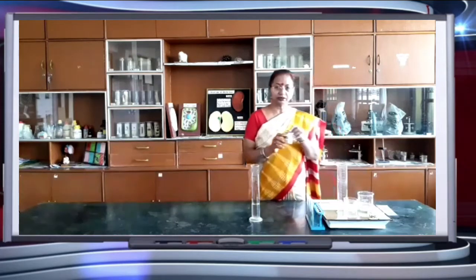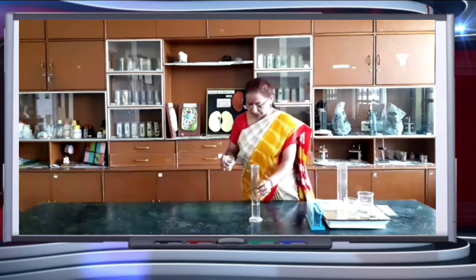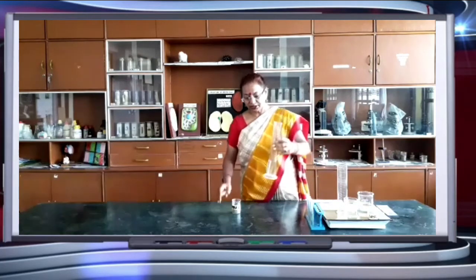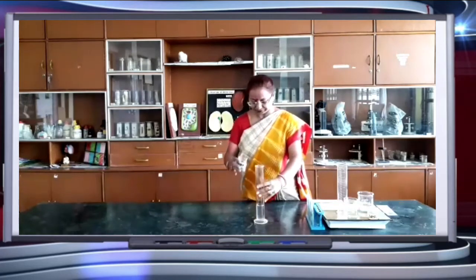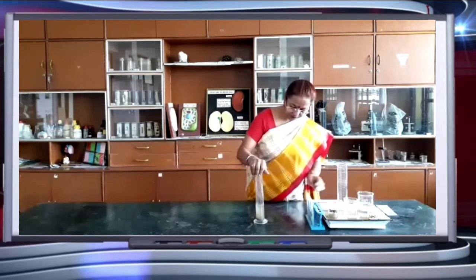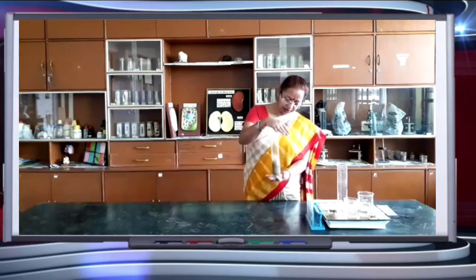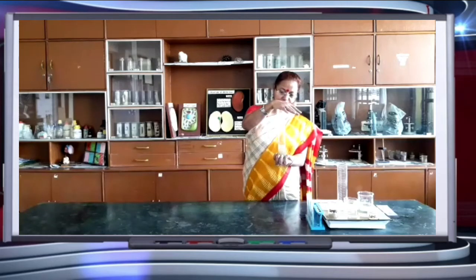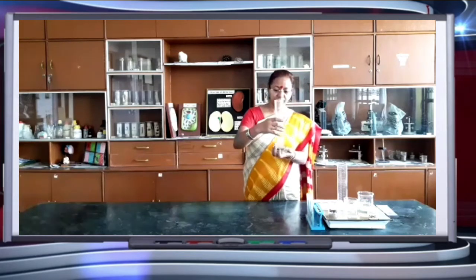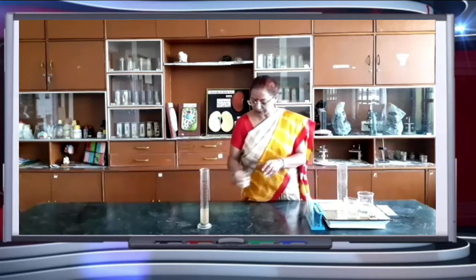This is sample 1 which I am adding in this measuring cylinder, and the water added is 30 ml. Then just cover it tightly and shake it. Leave it for some time. This is sample 1.